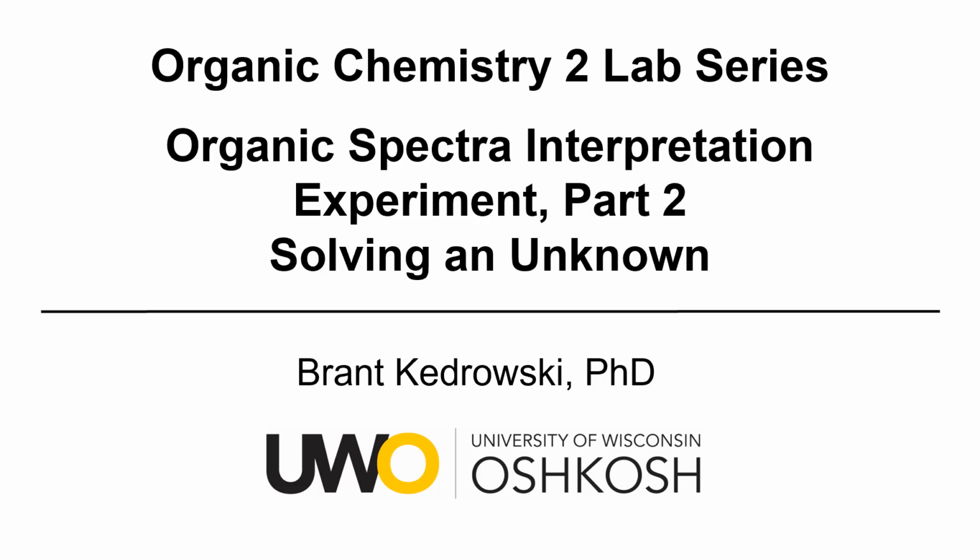In the previous video, we introduced this experiment and also went through a number of different tables of spectra data that you can use to interpret unknown spectra. We'll be using that information in this section to solve an unknown.